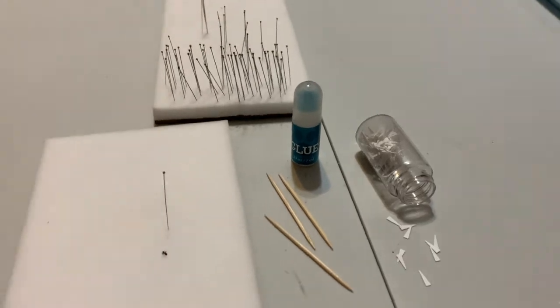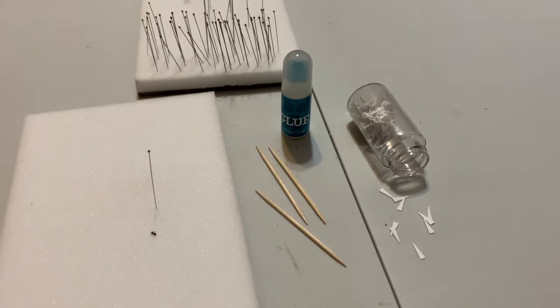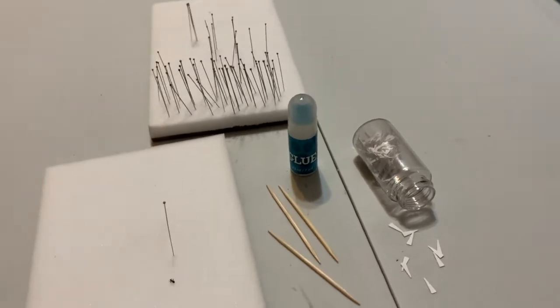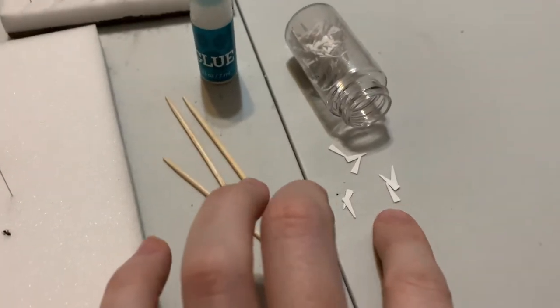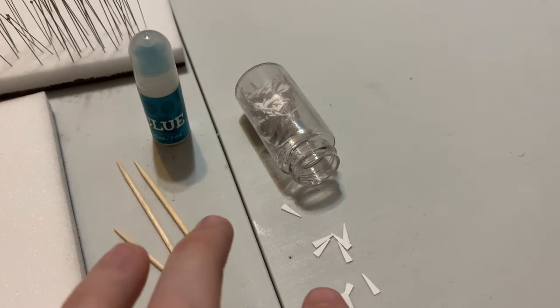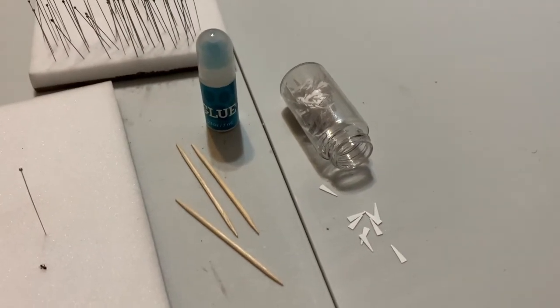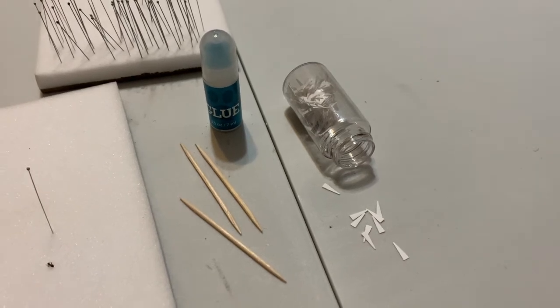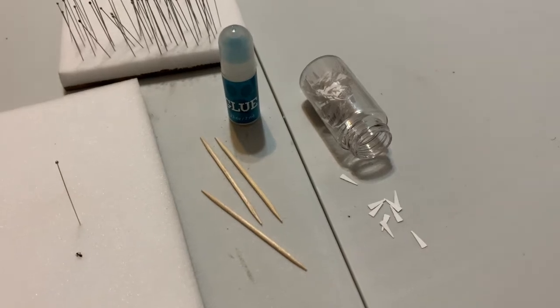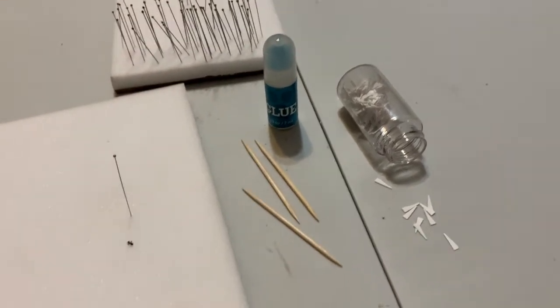All right, so this video is to show you guys how to point an insect. What is pointing? These little things right here are points. You can see these are all really uniform in size because they were cut out with a punch. You can make your own, but we can also provide some to you that were cut with a punch so that all of your points look very neat and uniform. So what do we need?